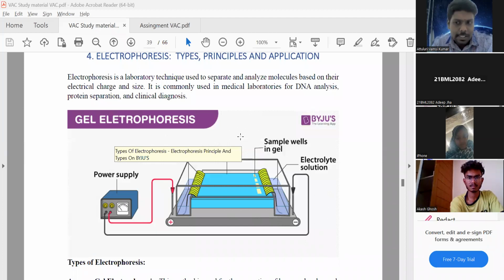That is the idea behind electrophoresis. Very simple. You suspend the specimen that needs to be separated in this gel, and you apply electricity at both ends of the gel tank, anode and cathode. There are certain things we need to consider. One is that the overall charge of the molecule should be negative. That can be achieved by adding some chemicals; I forgot the chemical, I think some buffers will be used to maintain an even charge among the DNA molecules. Then we run the sample by passing electricity and they get separated.